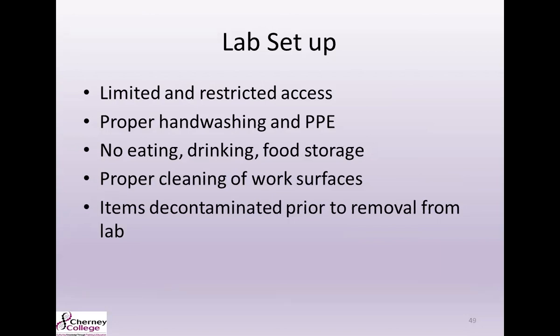Your lab should have limited and restricted access. Not everybody should just be able to wander in. Make sure you also have proper hand washing technique. Teach all your technicians about the risks and how to properly wash your hands. Too often we're in a rush. We just need to make sure that we're still following all those good laboratory practices and taking the time for proper hand washing and to put on your appropriate PPE.